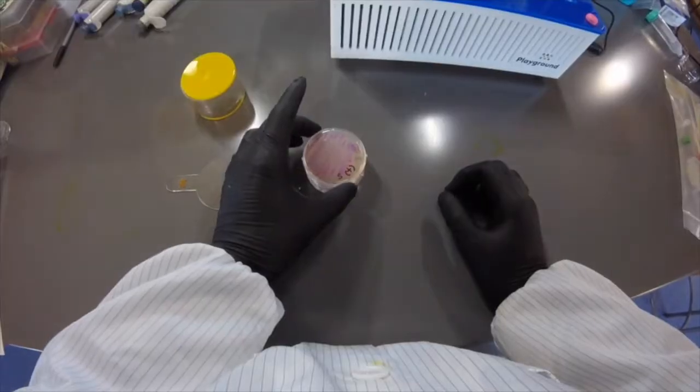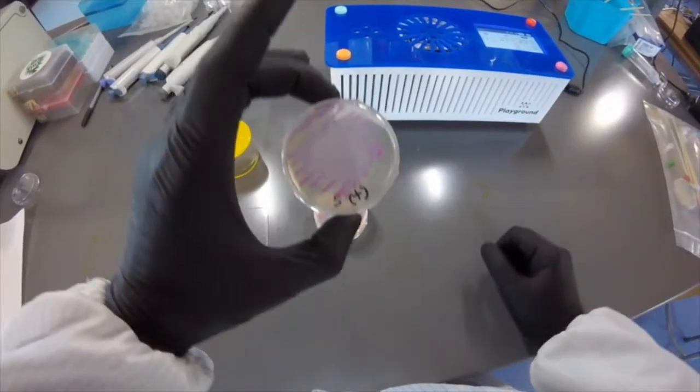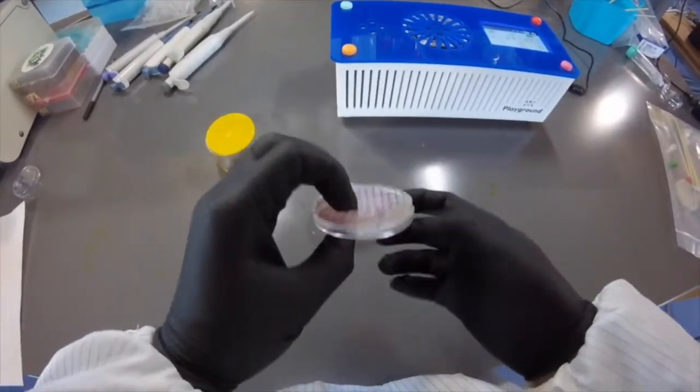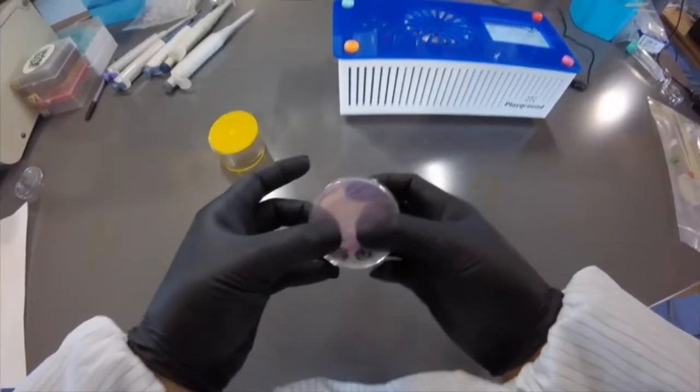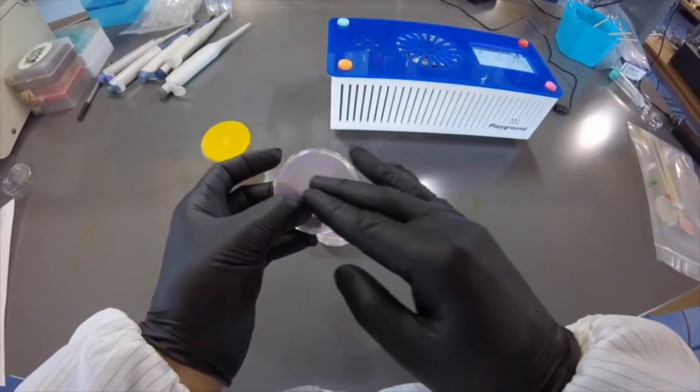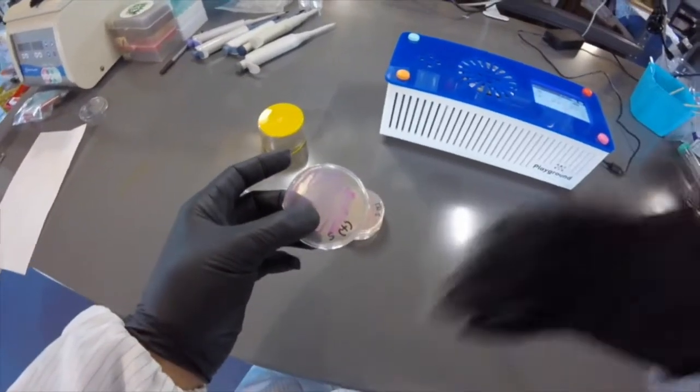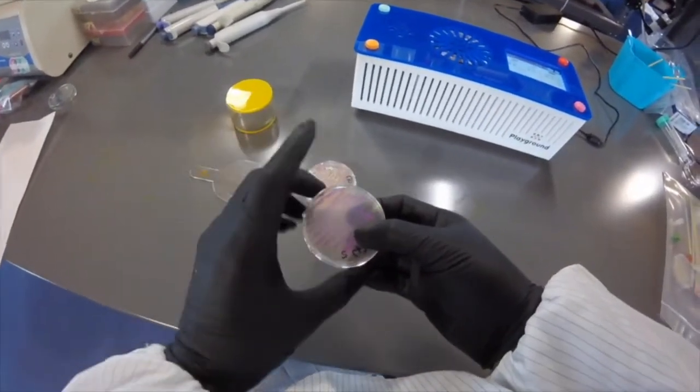As we can see, the positive control worked really well. This tells us that because we don't see other weird colonies, like white bacteria for example—it's all purple with a nice transition from darker to lighter purple—these plates are selective enough to ensure that only the engineered bacteria grow.